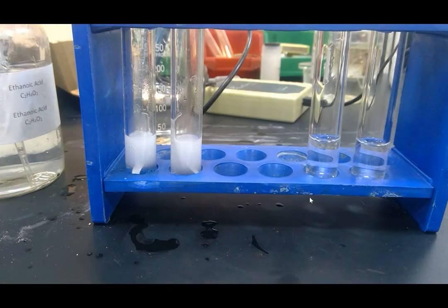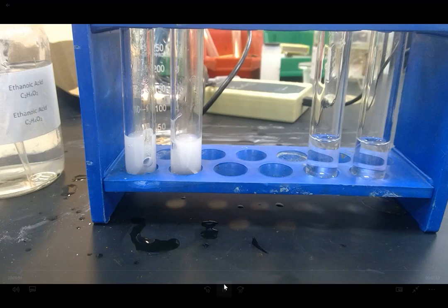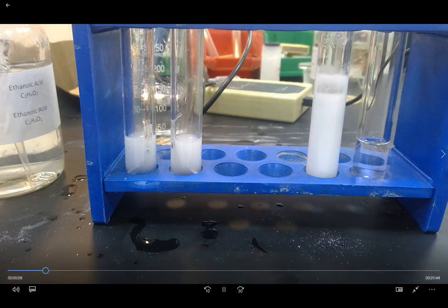The second reaction that I'm going to do is add sodium carbonate powder to each of these substances. What you should see with sodium carbonate powder is that carbon dioxide gas is produced, and carbon dioxide gas will be released as bubbles. Add a small spatula of sodium carbonate to each.